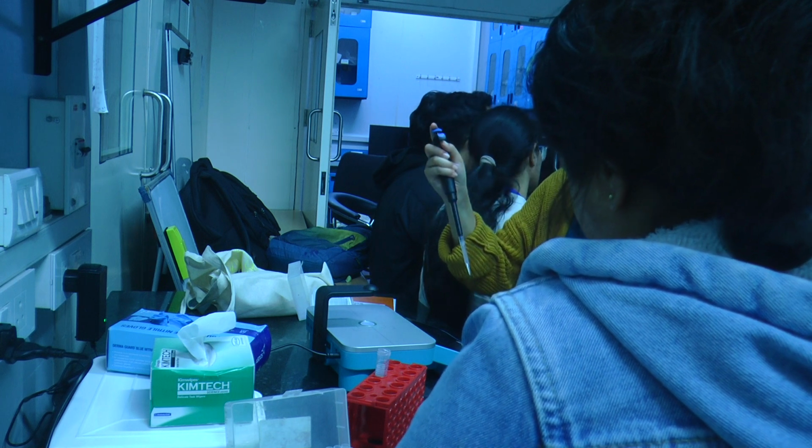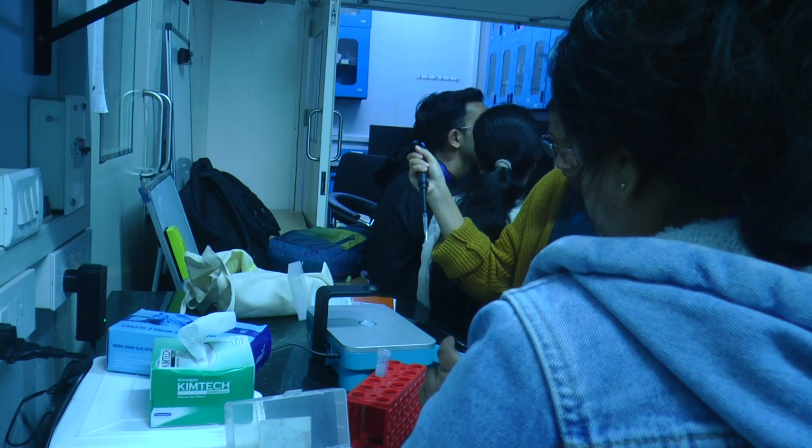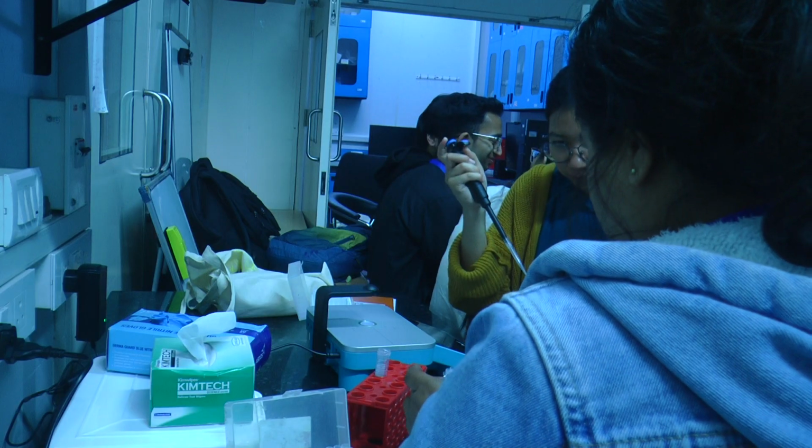It's okay. You can discard this one. No, you have to discard this buffer, the way you discard. And then this buffer again.